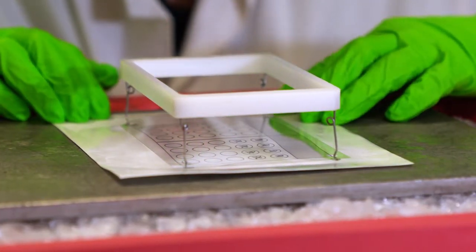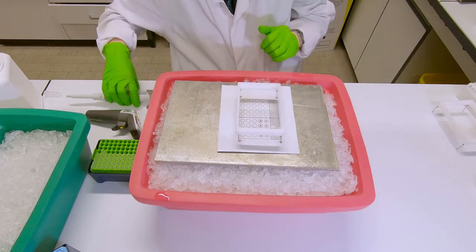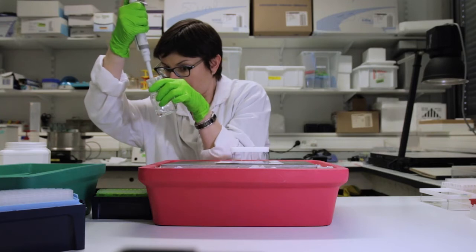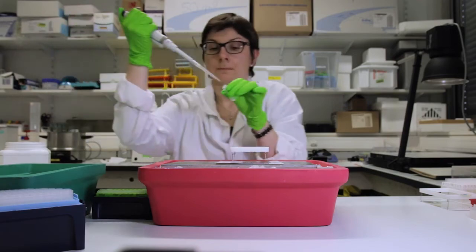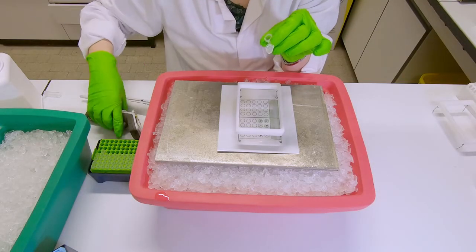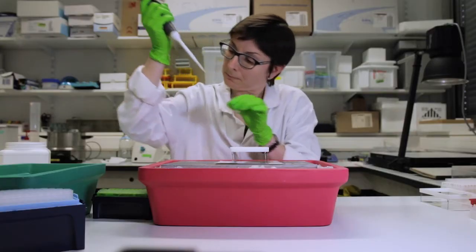Before starting molding the gels, make sure that your gel bond film is correctly placed on the template on top of the cold plate. In this case, we are going to start with a cell pellet containing a certain amount of lymphocytes. The pellet is going to be resuspended in 0.7% low melting point agarose in PBS. Then drops of 15 microliters are going to be placed on the gel bond film.